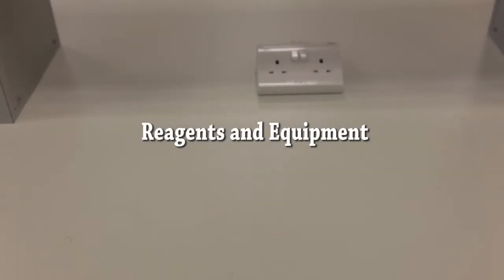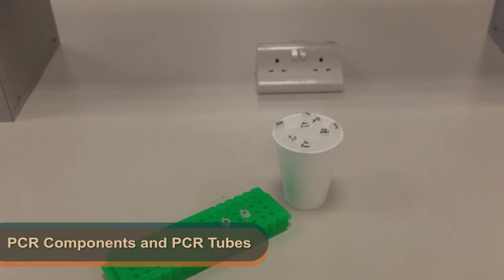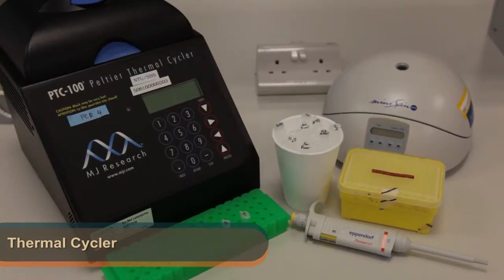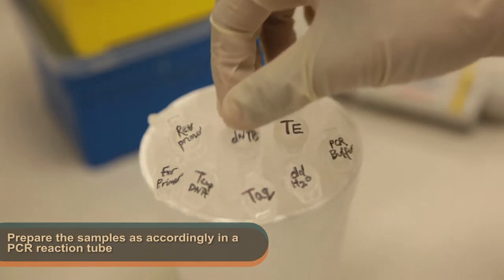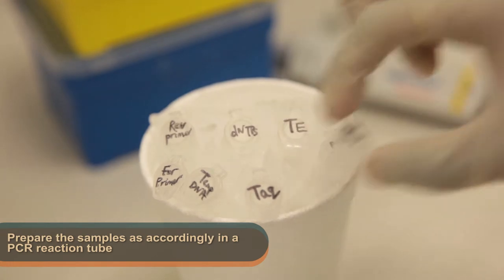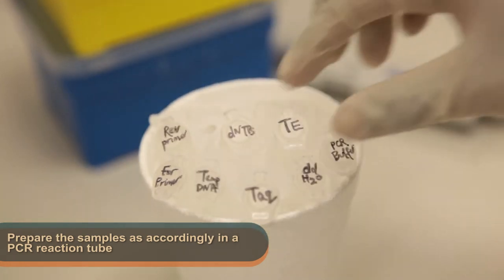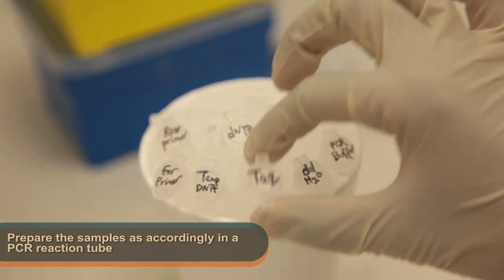These are the reagents and equipment needed. Do check if you have everything before you start. Firstly, prepare the sample as stated in the protocol in a PCR reaction tube. Do remember to label both reaction tubes with their designated labels followed by your initials.